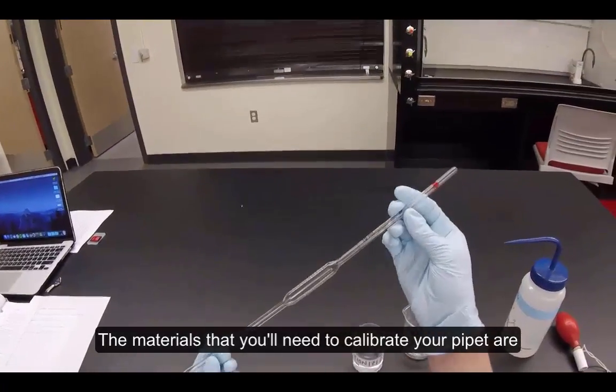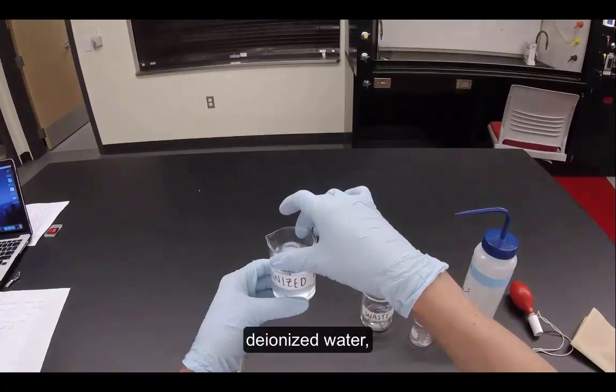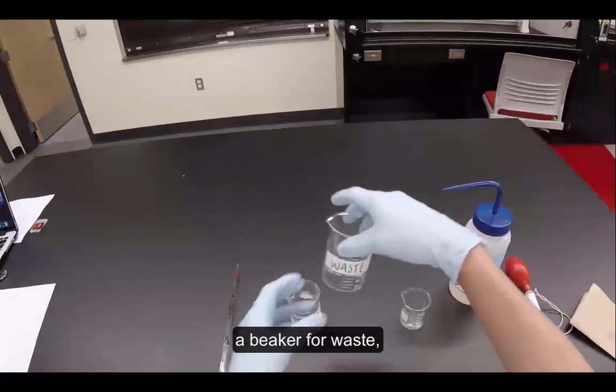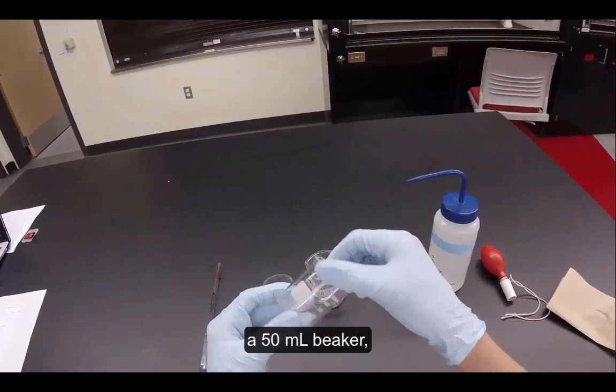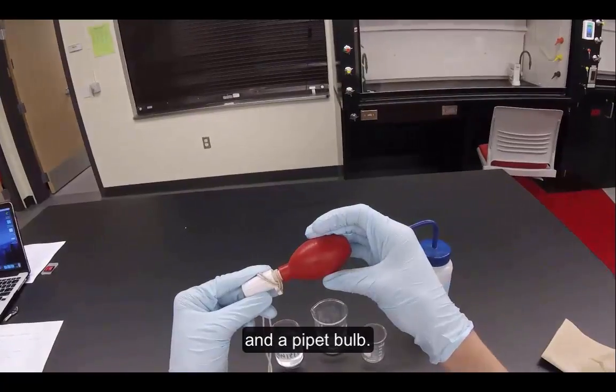The materials that you'll need to calibrate your pipette are your pipette, deionized water, a beaker for waste, a 50 milliliter beaker, deionized water in a spray bottle, and a pipette bulb.